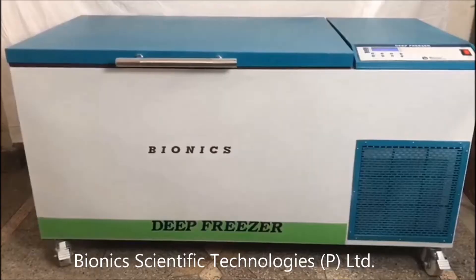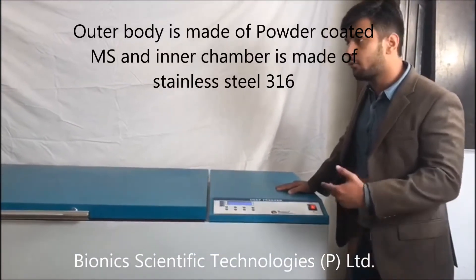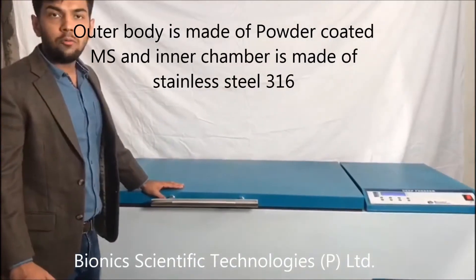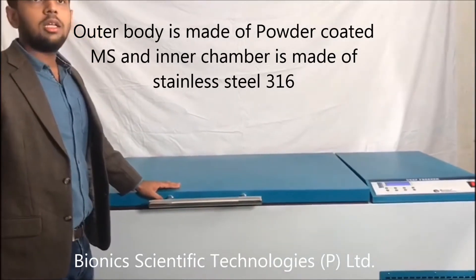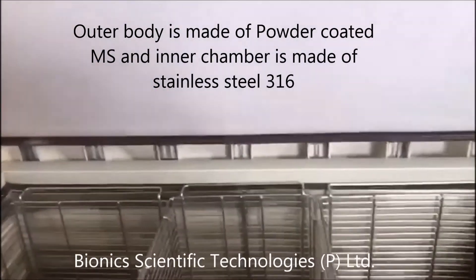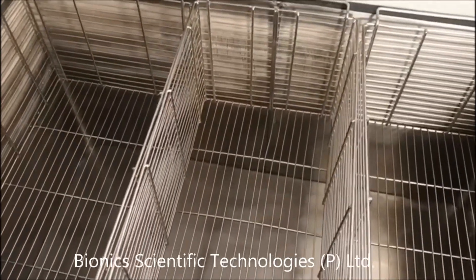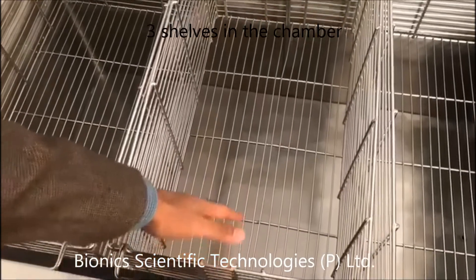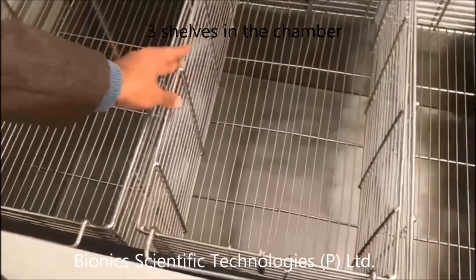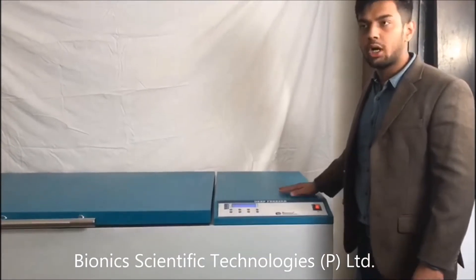This machine is completely made up of MS on the outside, and from the inner side it is made up of SS. The inner chamber of this deep freezer is completely made up of stainless steel — SS316. These are the three shelves which you can also adjust according to your needs.